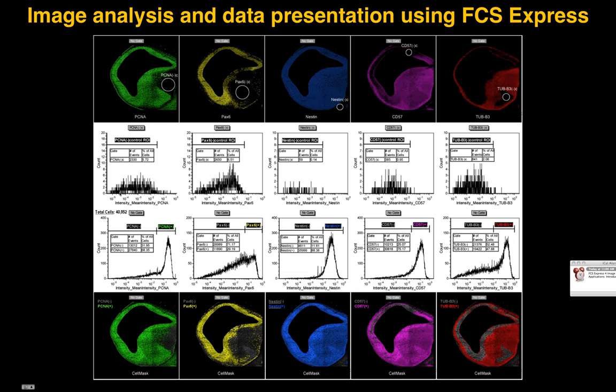Why is this important? Because once we have the mean intensity and a histogram representation of the range of autofluorescence of negative cells, we can create a marker region of interest where we identify the thresholds, like Strong has mentioned in his presentation, where we have a boundary where the brightest autofluorescent cells end, and above that would be the positive cells.